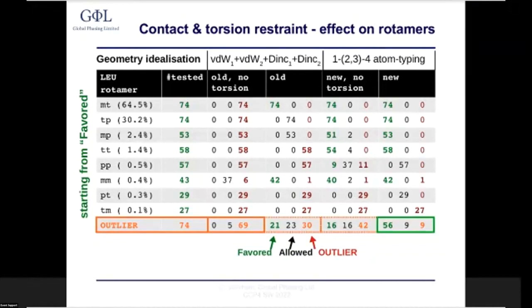The impact of a change in 1,4 contact terms on sidechain rotamers seems quite obvious. After all, these are contacts of atoms that are connected through a sidechain chi-angle, but there are other effects visible as well. Here we look at the RMS bond and RMS angle values that are achievable with the same set of refinements as shown before.